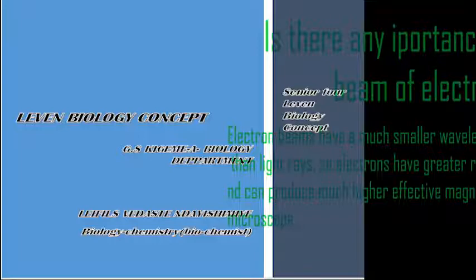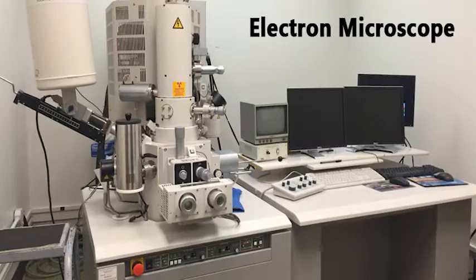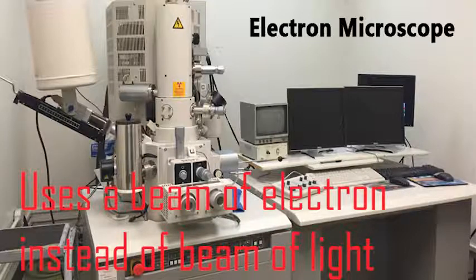So today we are going to describe the electron microscope. The electron microscope is a more powerful device than the light microscope. It uses a beam of electrons instead of a beam of light.